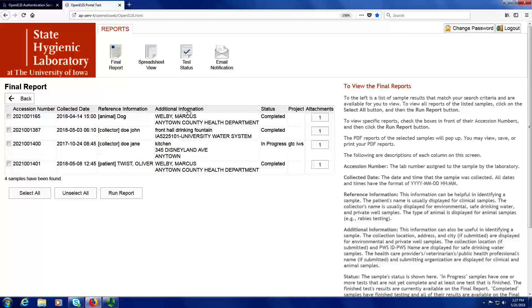There is additional information shown in the next column. For animal samples and clinical samples, the provider is shown: last name, comma, first name of the provider, followed by the organization that submitted the sample — in this case, Anytown County Health Department. For safe drinking water samples, the collection location is shown on the first line, and on the second line is displayed the public water supply ID dash public water supply name. For environmental samples, the collection location is also displayed on the first line, and the second and third lines contain the address and city, state, and zip of the collection location if that was provided on the collection form.